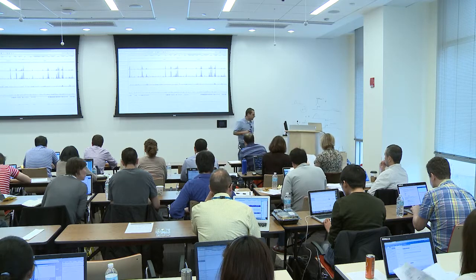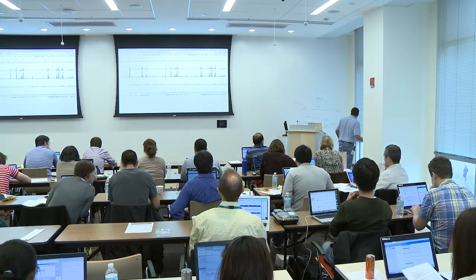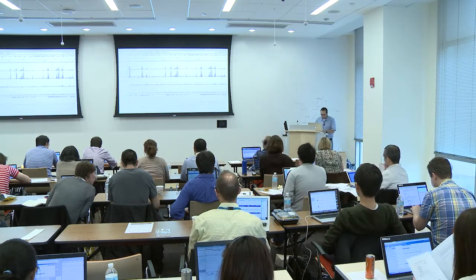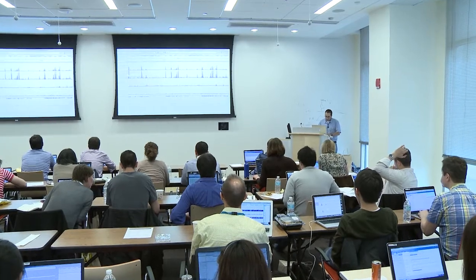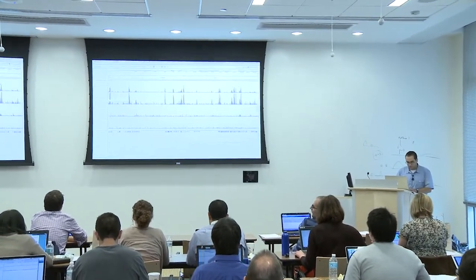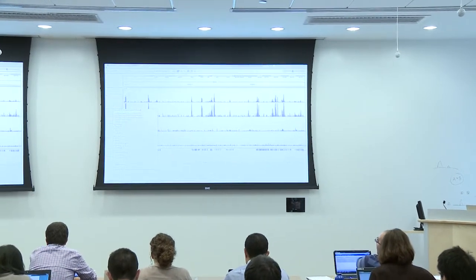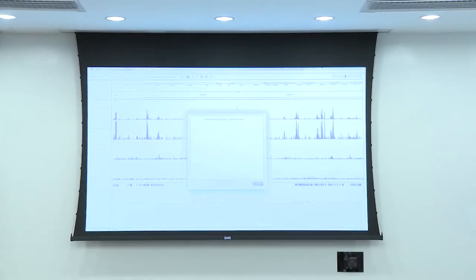Okay, I will revisit it later with people that didn't get to the IGV yet, but I want to give you some feeling of how it works. I use a lot of right-click, and for instance, if I right-click on this, I can do remove track because I put 2 of them together.